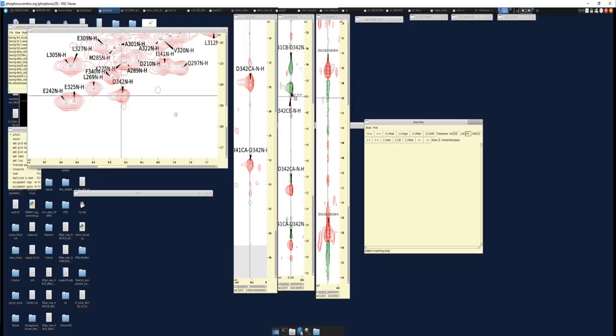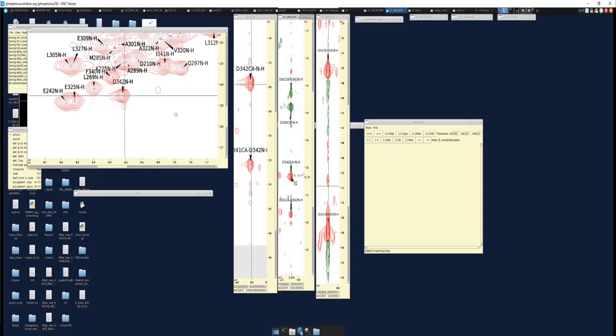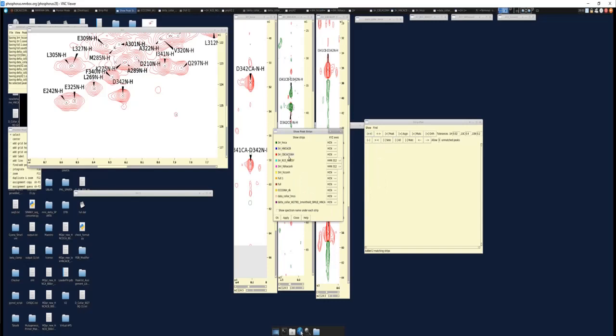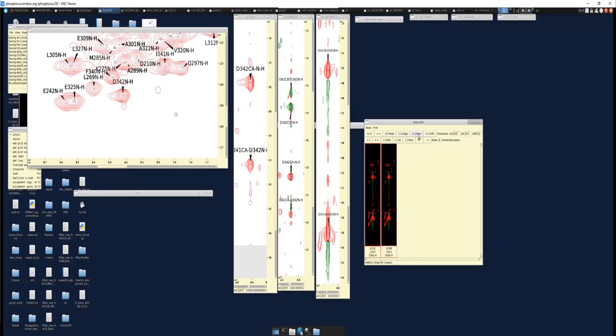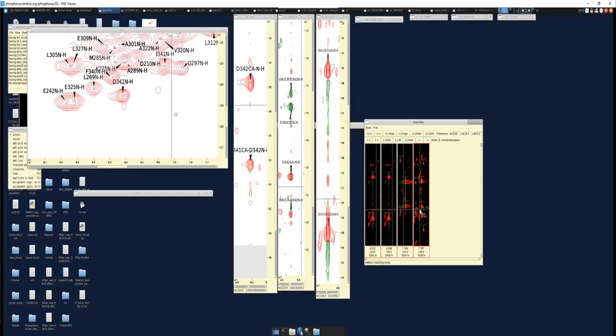However, as I said earlier, one of the additional benefits is you can exclusively search I-1s by going forward. Or sorry, I+1s by going forward using the CBCA, and that will get you fewer matches. So in this case, you pick the I peak that you want to search, and you search your CBCACONH, and so now we're going forward. So we'll click peak, and we'll do match, right? So in this instance, I have two matches, right?